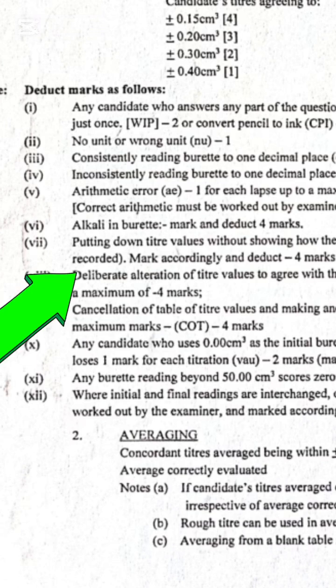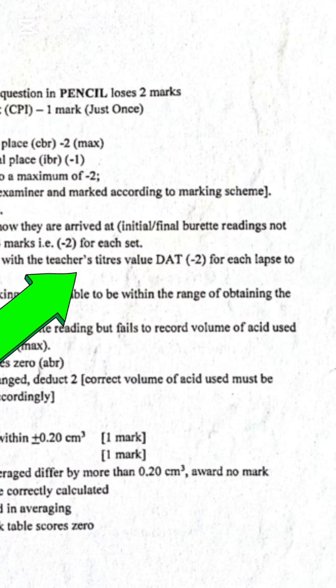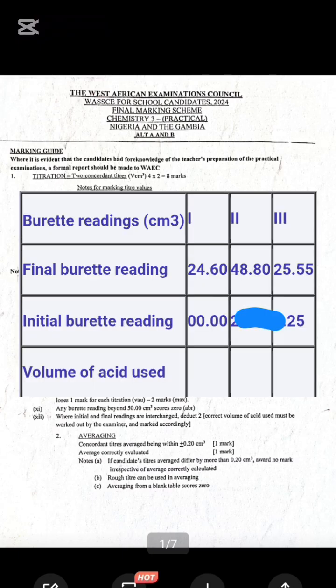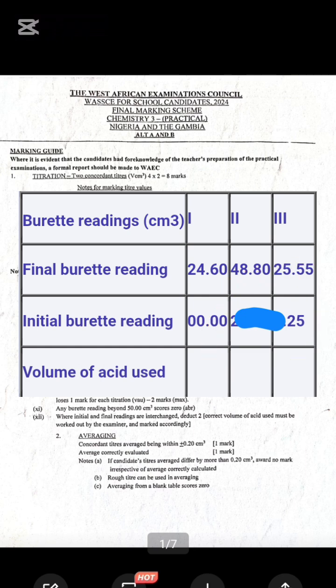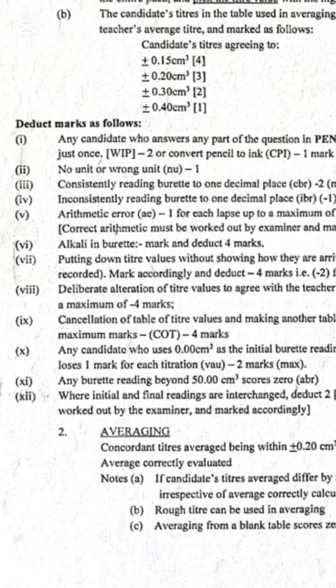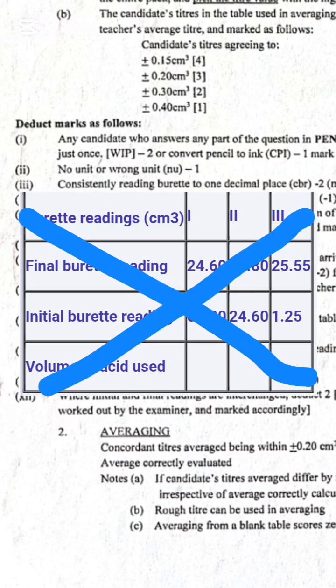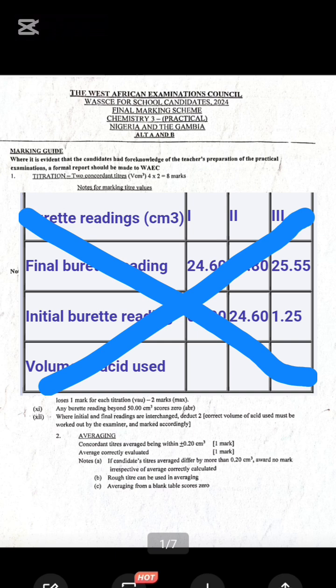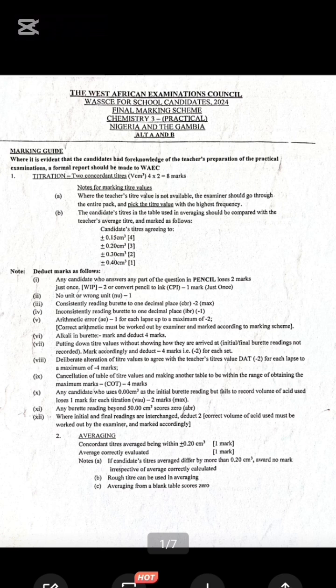Number eight: deliberate alteration of titre values to agree with the teacher's titre values — we call it DAT. That means you wrote a titre value, then shaded it or changed it for any reason. The maximum deduction is minus four. Number nine: cancellation of the table of titre values and making another table to be within range of obtaining maximum marks — we call it COT — minus four. You must not cancel your table. That's also why some teachers tell you to use pencil to draw the table, which makes you fall victim of error number one if you forget to erase the pencil.